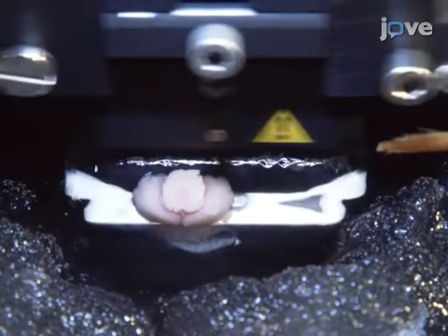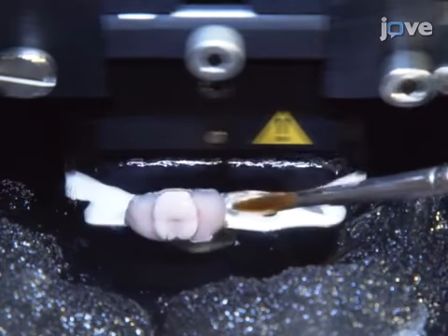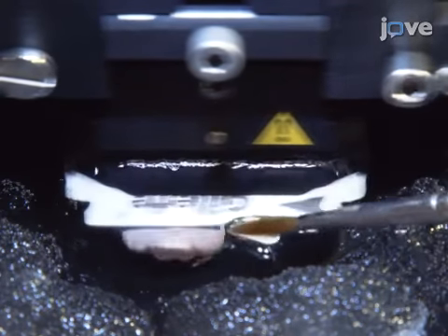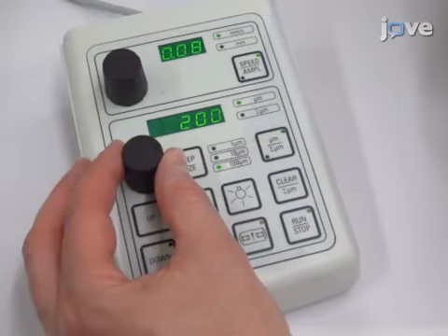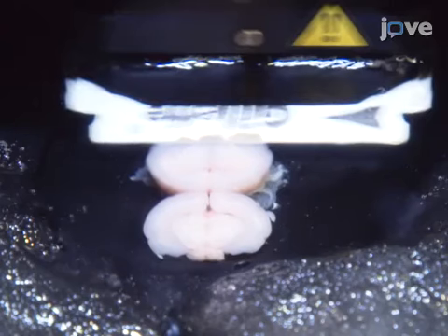Cut coronal brain slices of about 500 micrometers in the caudal to nasal direction before reaching the substantia nigra. Then, adjust the thickness to cut 300 micrometer slices containing the region of interest.